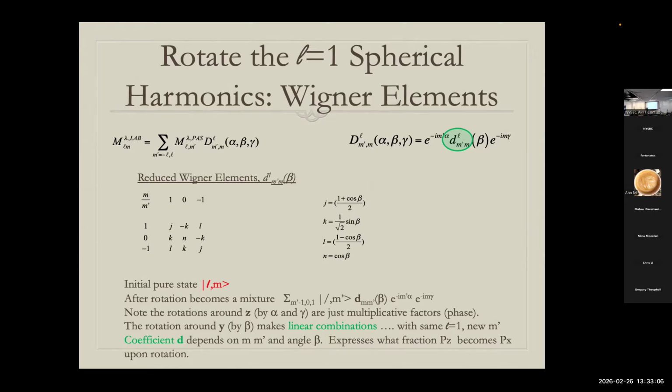The thing I need to do is say, well, in the PAS, how much did you have? Whatever that is, multiplied by J. Well, what's J? It's trigonometry. Of course, it depends on what angle we rotate.